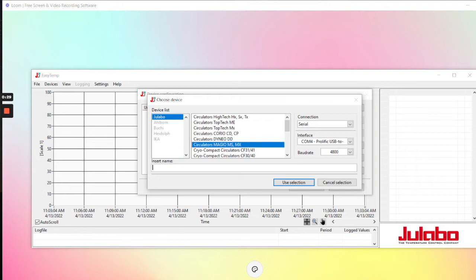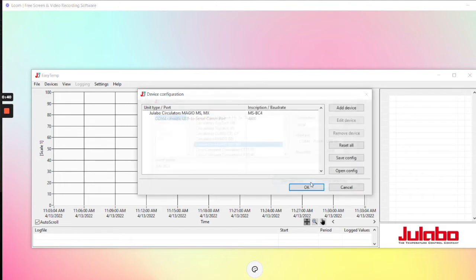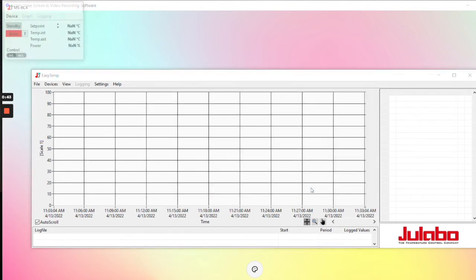You just need to make sure that that is the correct COM that is showing up on your computer. Name your device, click Use Selection, and click OK.